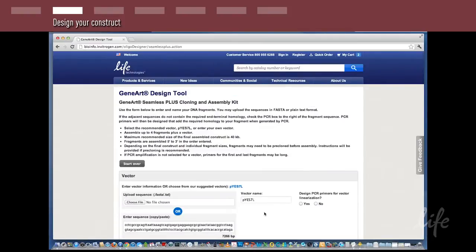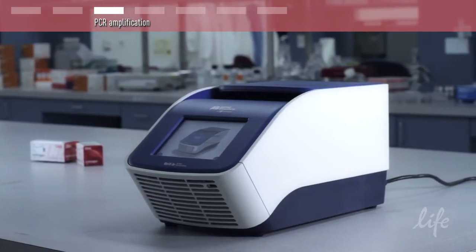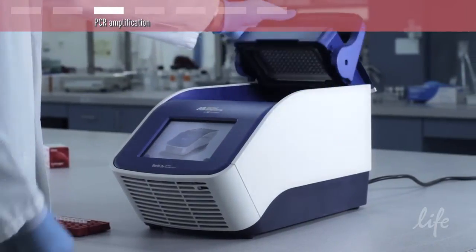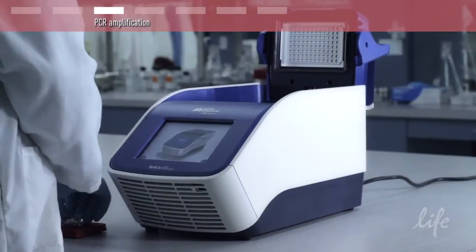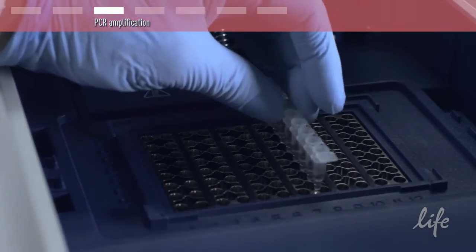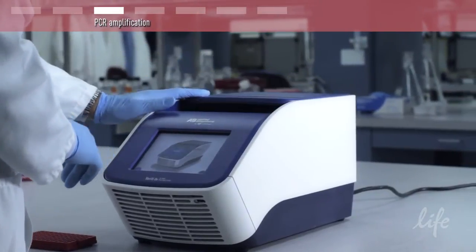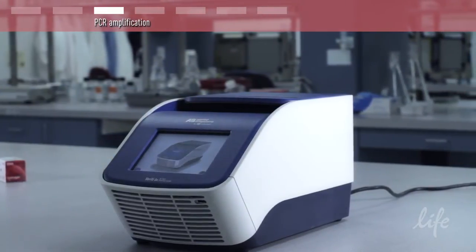The next step is PCR amplification to introduce end-terminal homology if it's required for assembly. This kit guarantees assembly of up to four fragments and constructs of up to 40 kb. However, many scientists have had success using the kit to assemble seven fragments and constructs of up to 50 kb.